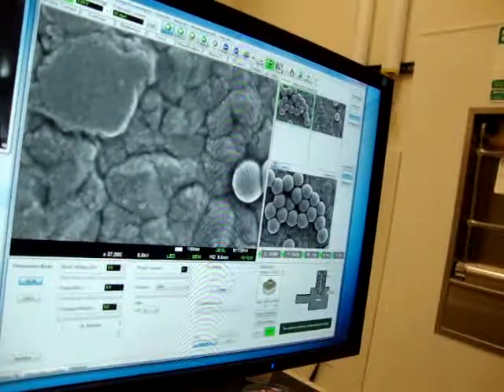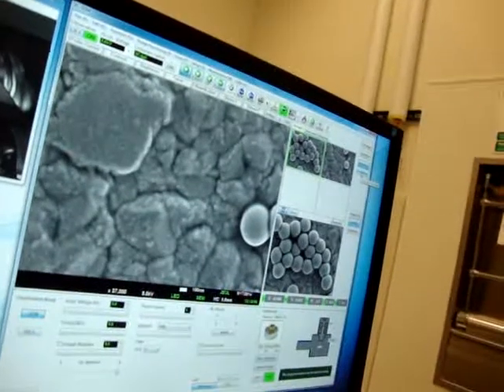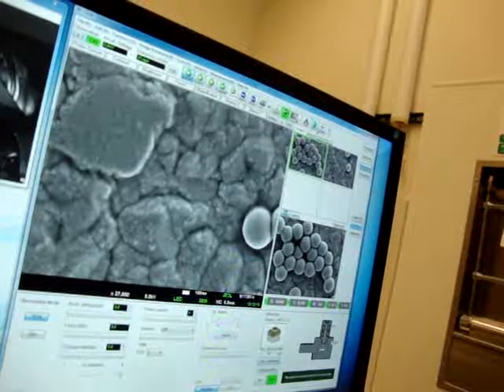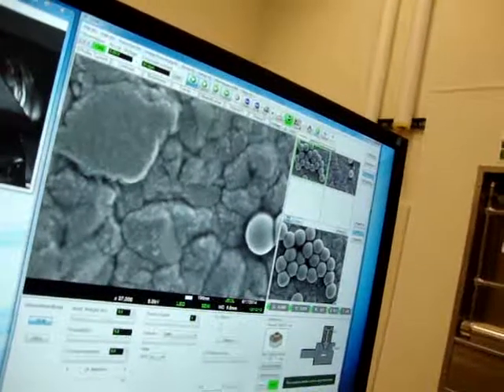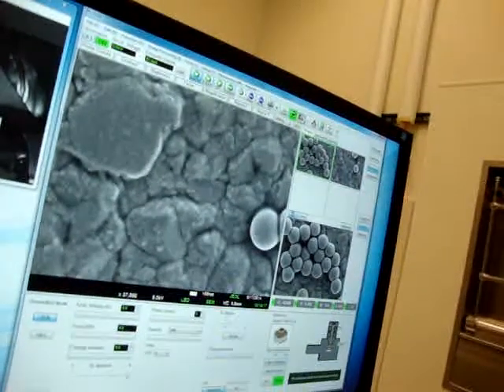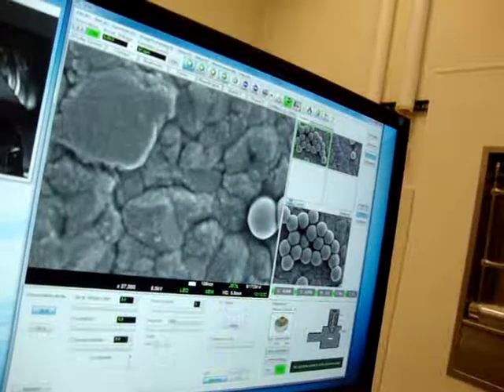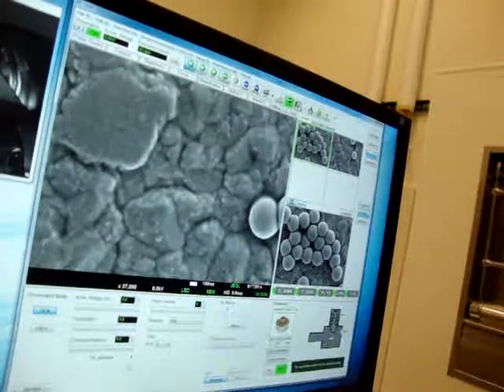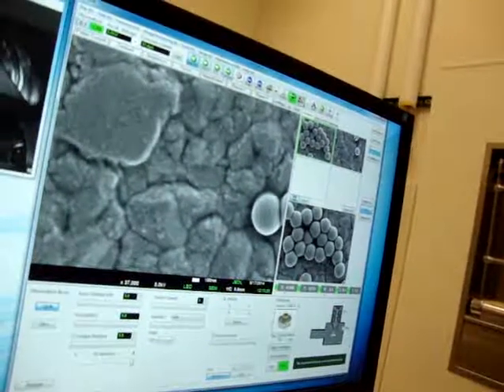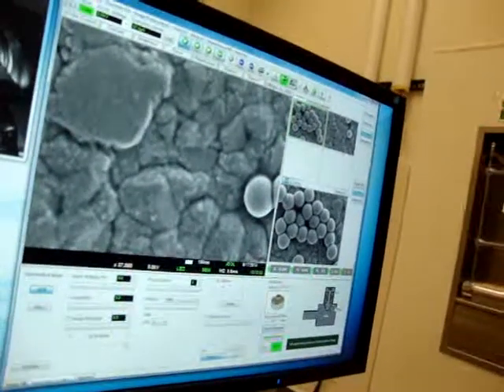One question I had: comparison specimen, full image, cursor. Oh, image rotation. That just rotates the image, not the stage. Right. How do you rotate the stage? With R. Oh! And you just punch in the degree? Okay. With R, X, Y, and what is T? Tilt. Okay. So you can just do everything from here.